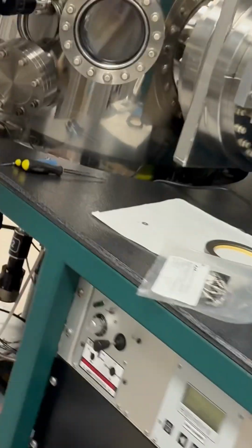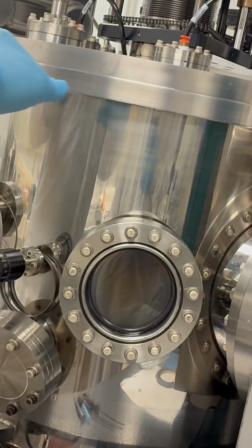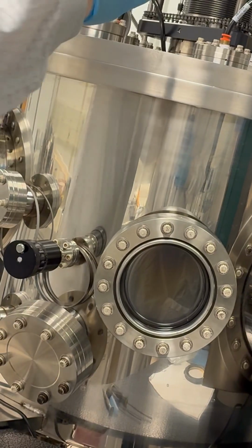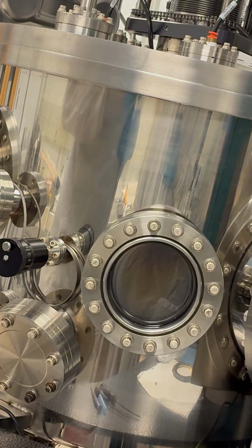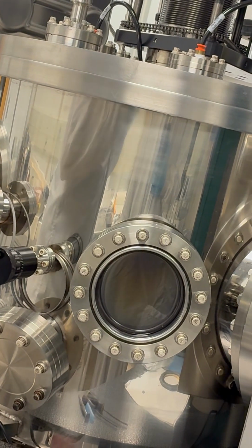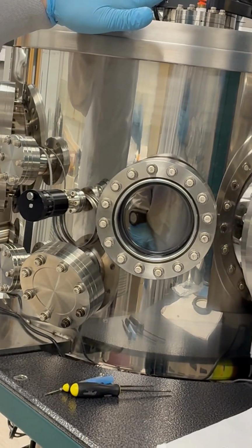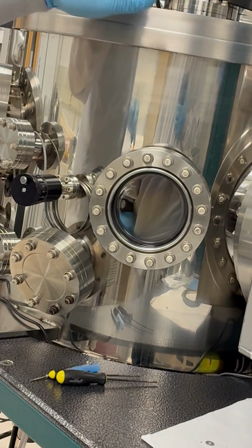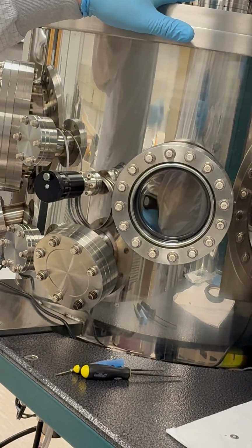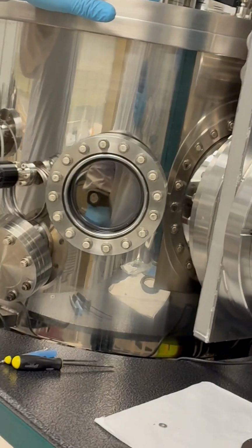What I did was, if you look into the chamber, the QCM is actually at the height your sample normally grows at. When we actually do the growth, we move the QCM out of the way and we lower the sample down to the exact same height that the QCM is. And so the tooling factor is 1. It would normally measure the exact same number, right? Because when we do a normal growth in this chamber, we're not monitoring it. We're just going based off of the growth rate and the time, okay? That's usually good enough for almost everything someone does, right?